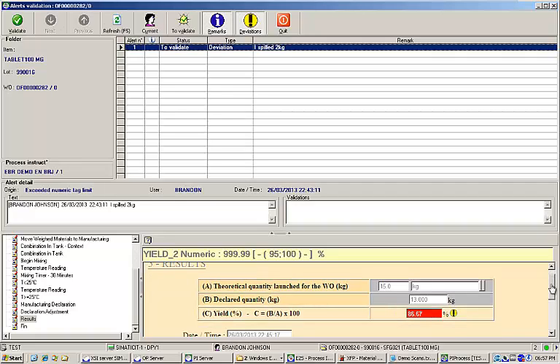This feature enables one of the most exciting and beneficial functions of EBR, batch review by exception. By building strong data validation into your batch records, EBR can allow your quality reviewers to focus on just the data fields that are out of range and avoid needing to double check every field on the batch record.